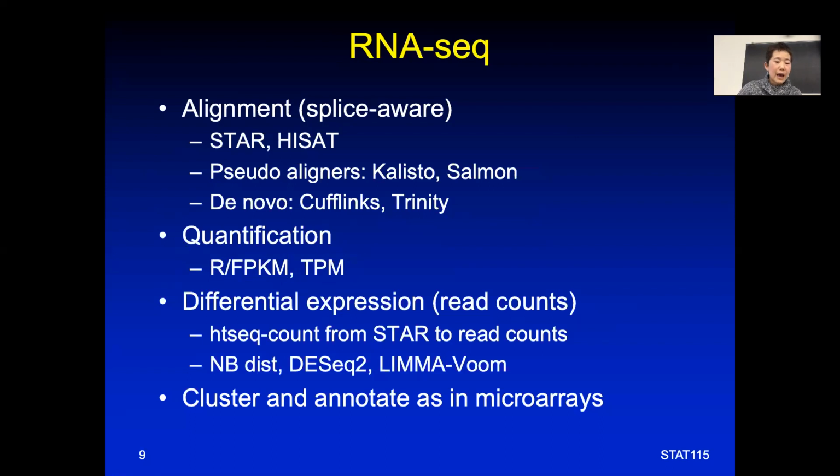However, when you try to calculate differential gene expression, quantification is just how much this gene is expressed, but the long genes do have more reads. And when you calculate the differential expression, the longer genes will have better power of detecting differential expression level. And so for quantification, I think we should use TPM, but for differential expression, we should use the actual read count. You want to normalize a little bit and adjust for GC content a little bit, which pseudo-aligners like Salmon already do.